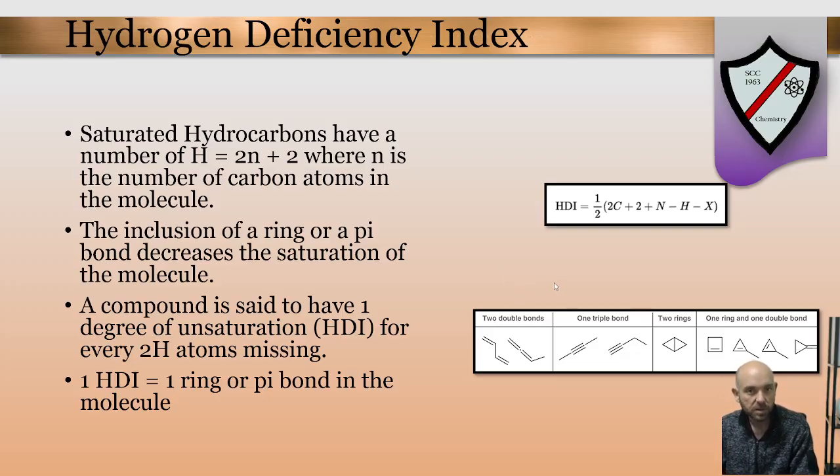So that degrees of unsaturation will at least start to give you some idea as to possible structural components of that molecule just using the chemical formula, which you can sometimes get from just doing a mass spectra and maybe including some IR spectra information along with that. Of course, later on in the course, we're going to learn how to use NMR spectroscopy to really wrap it all up together and determine overall structures of our molecules. But up until that point, we can at least start to predict what structures may be available to us in that molecule.